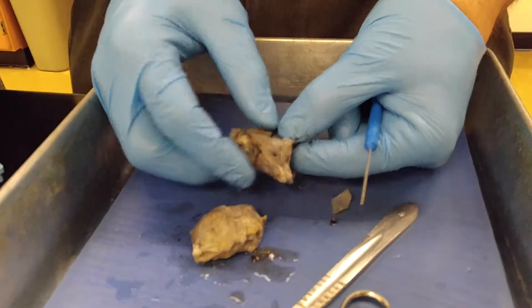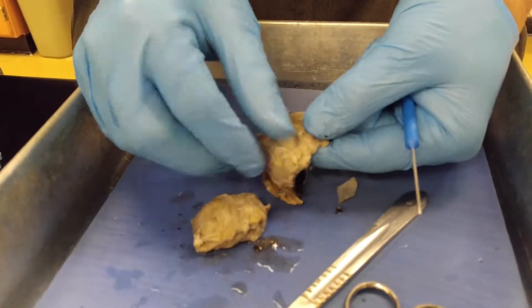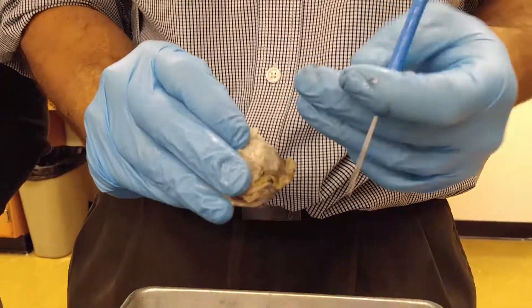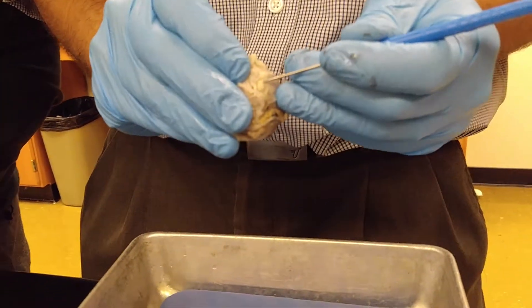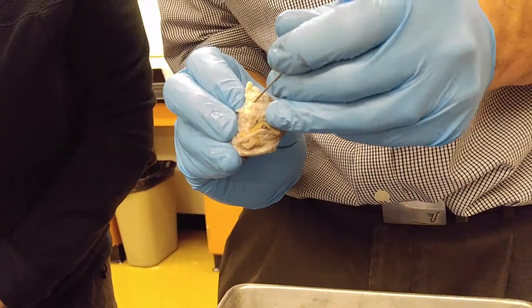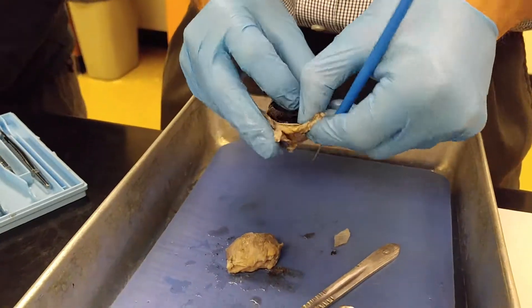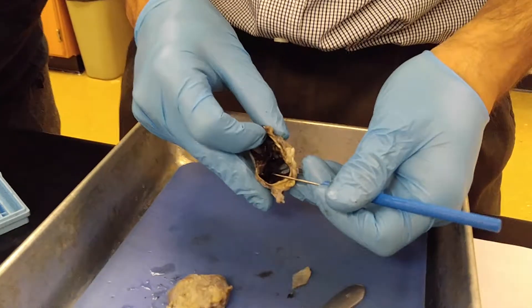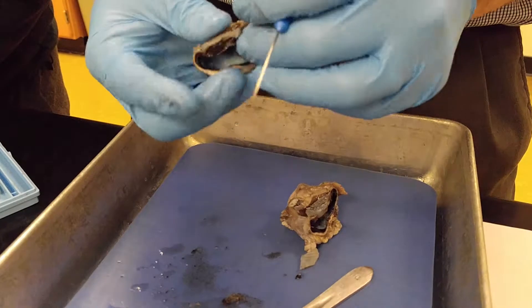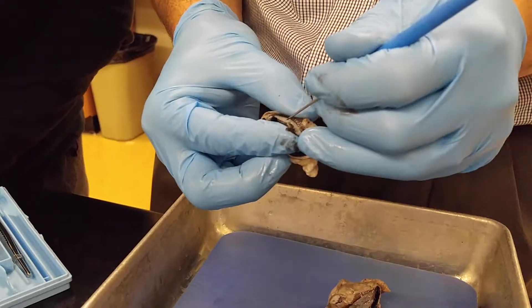The cornea is the outer layer, continuous in the back with the sclera right here. That is the optic nerve. This black layer is the choroid. On this side, I cut the cornea to see the iris right here.